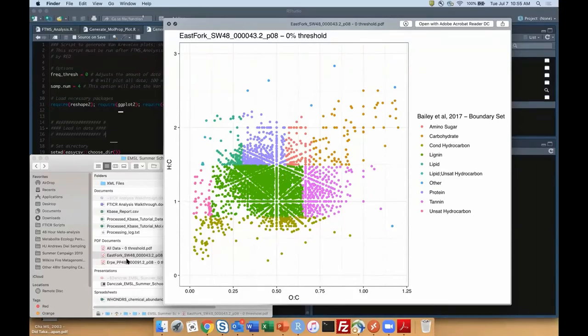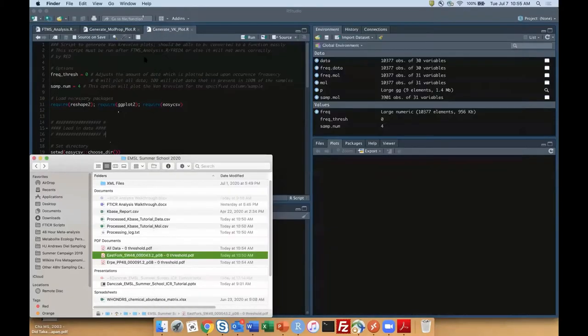I know what that error is. That sounds like you probably didn't get the... there might have been an error in Annette, sorry to speak specifically. It sounds like that might have been an error in loading in or installing the FTMS R analysis package.